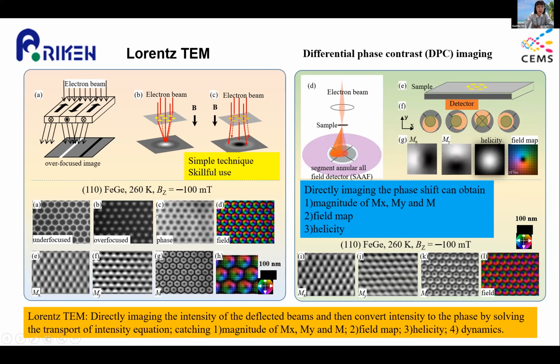Then we analyze these Lorentz TEM images by using the transport of intensity equation technique to extract the phase image.